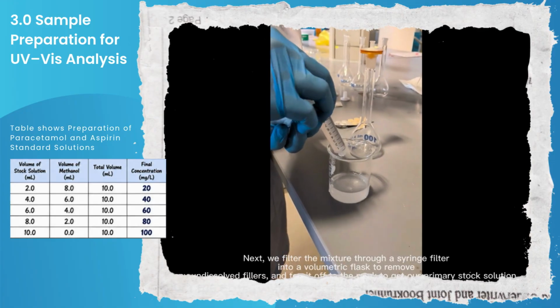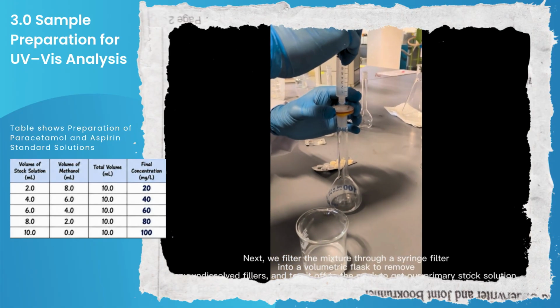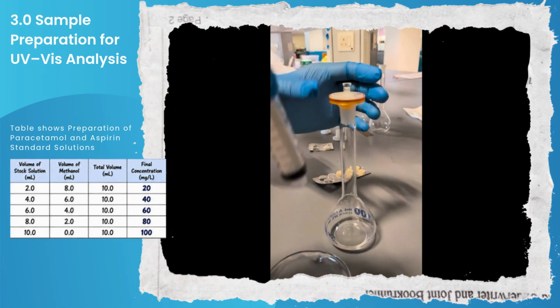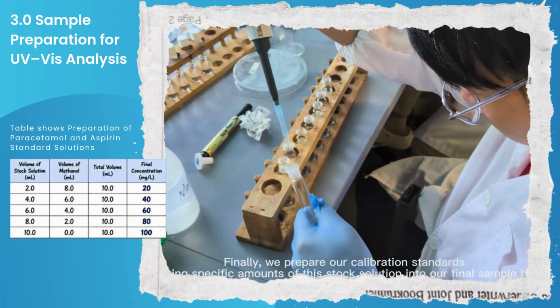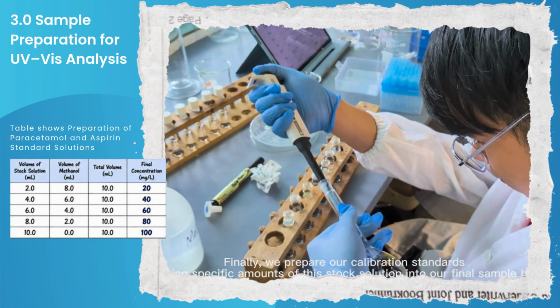Next, we filter the mixture through a syringe filter into a volumetric flask to remove any undissolved filler and top it off to the mark to get our primary stock solution. Finally, we prepare our calibration standard by diluting a specific amount of this stock solution into our final sample bottles.